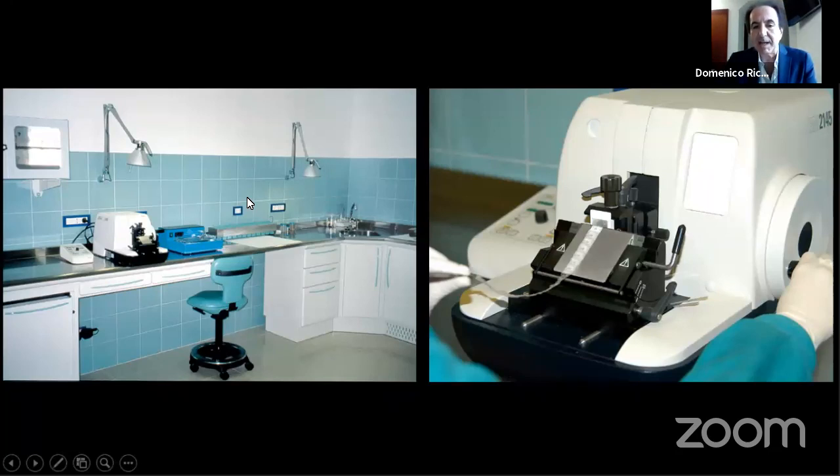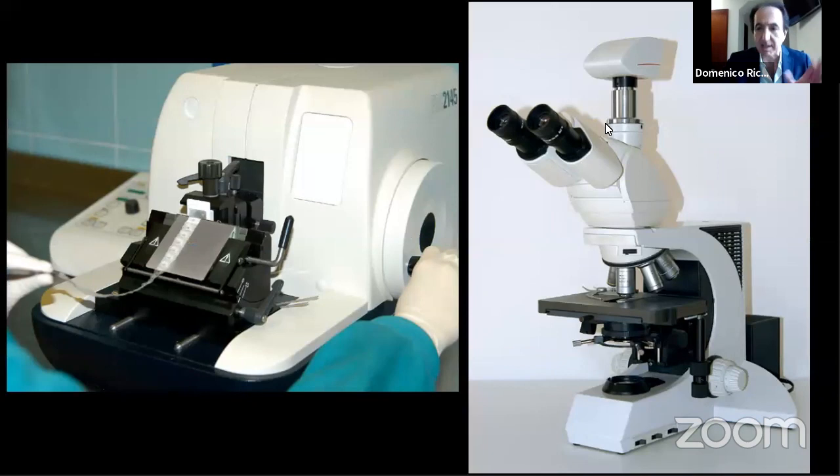So an important part of the histological methodology is the serial sections. The serial sectioning procedure is pretty difficult. It means that for a single tooth, a single specimen, you have to cut a lot of sections. Sometimes it can be 500 to 1,000 sections. You have to cut completely through the specimen. Only then can you come to the conclusion that something is or is not there. And this is very important.